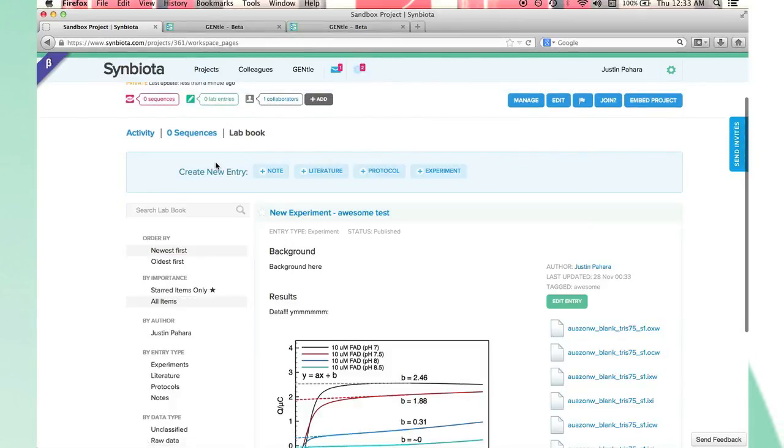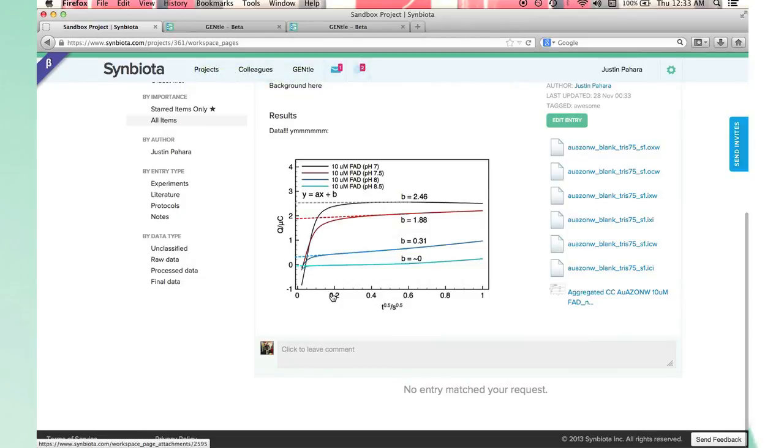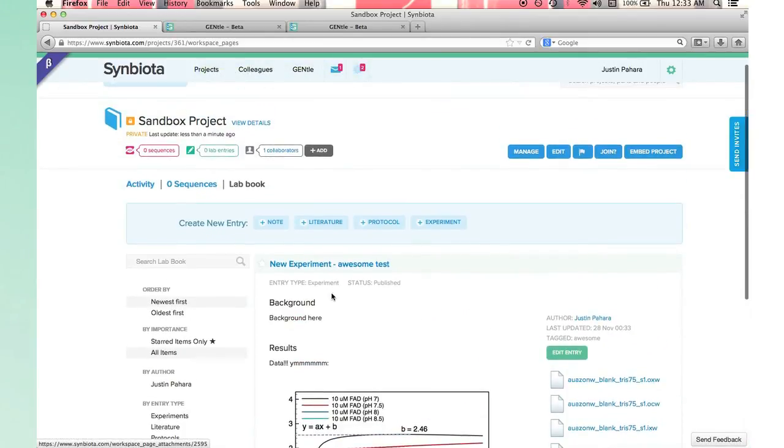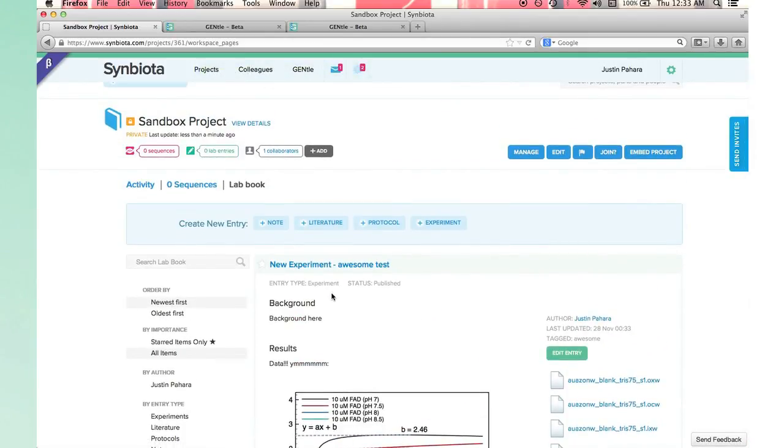The more data and lab book entries you have, the more you'll realize the utility of Synbiota. As you move forward in your research, Synbiota will ensure that your projects and data can be used and built upon by others.